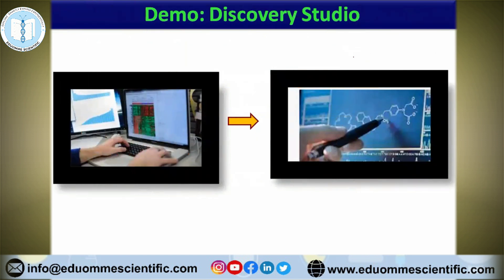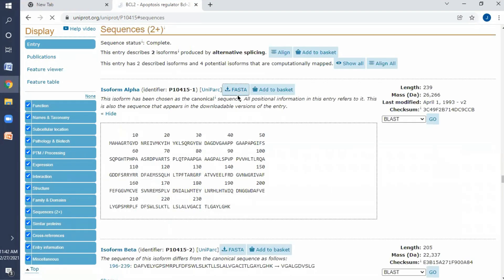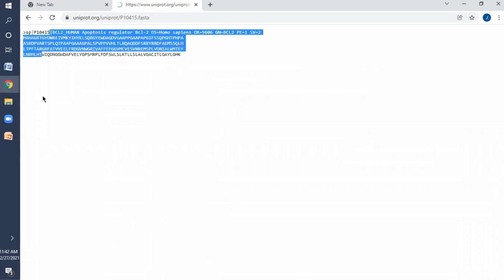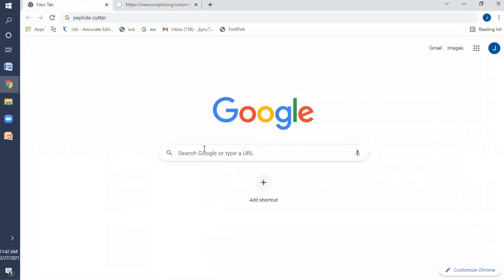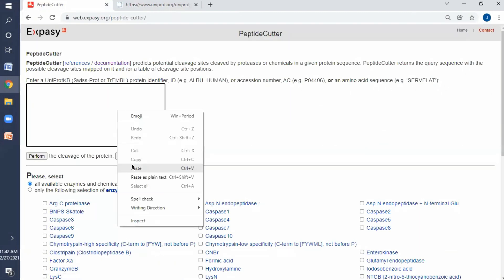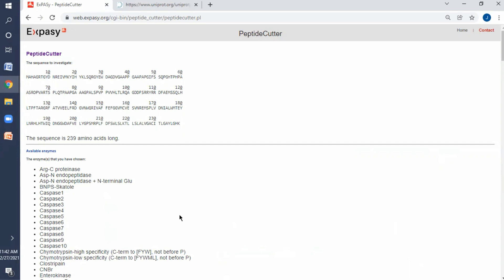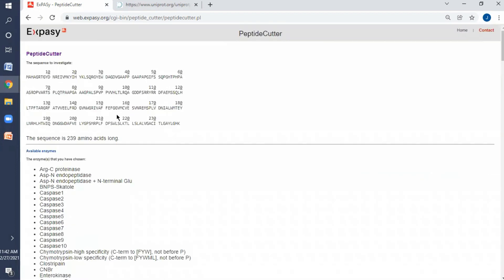Let's do a demo so we can get more insight into how this tool works. You can get your protein sequence from UniProt or NCBI Protein. If you want only the ID, just take the UniProt ID; otherwise take the plain sequence of your protein. In this case, BCL2 protein is 239 amino acids. We go to Peptide Cutter — this is the explicit page with the Peptide Cutter tool. Here, either the UniProt ID or the sequence we paste. In default setting, I'm performing the prediction. These are the input sequences we provided, and you can see these are the enzymes alphabetically arranged which are capable of cleaving this peptide and protein.